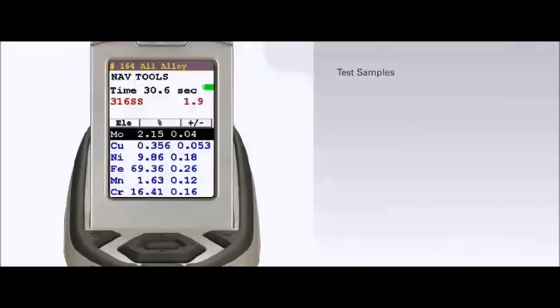Here you see the reading number, which identifies the sample reading and the test mode used for the measurement. The reading number for this stainless steel sample is 164, and we tested in the alloy mode. The measurement time for this sample was a full 30 seconds.